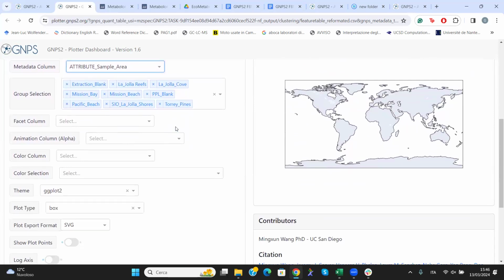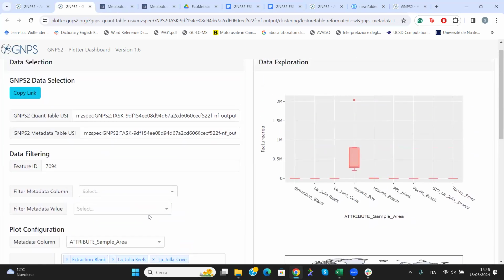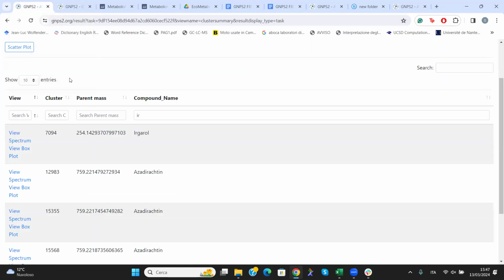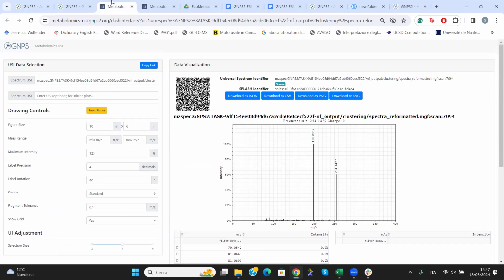As before, here you can do many things, but mostly you can export your picture in different formats, so this is pretty ready for a paper or for whatever you want to use it for. Yes, some question? Yeah, honestly, it's just an output of all the analysis.